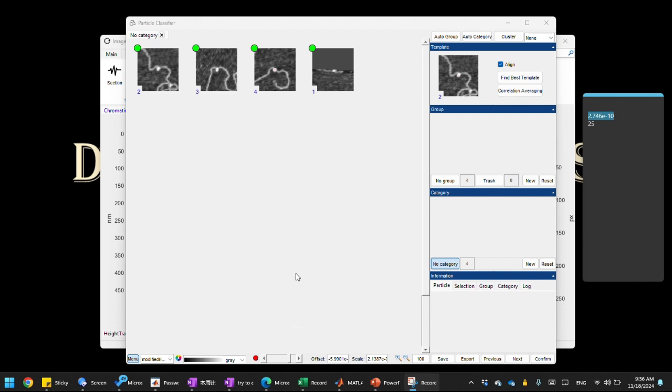So one thing to take note of using this approach is we cannot see the boxed region that we chose for our correlation analysis. That's one limitation in this approach. So if you try to see this mask better, you can see only the particles that we masked earlier are shown here, right?